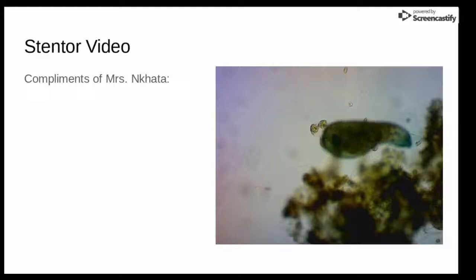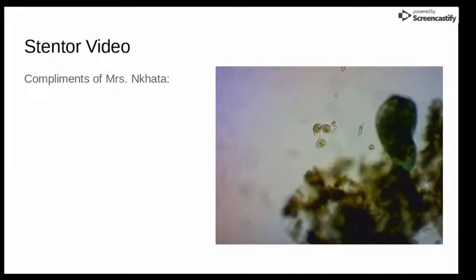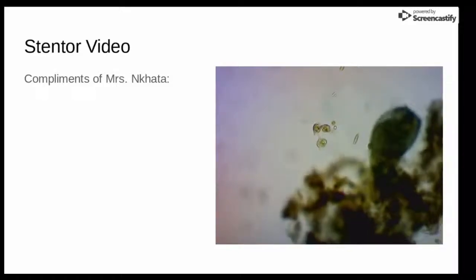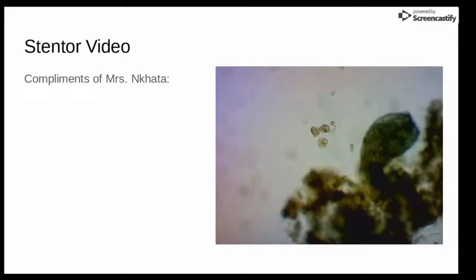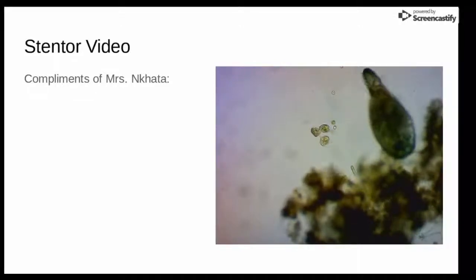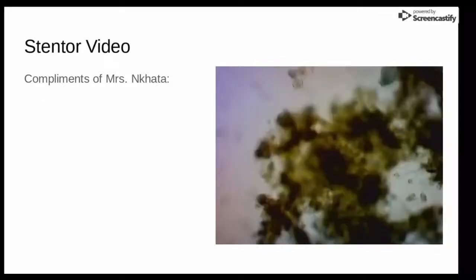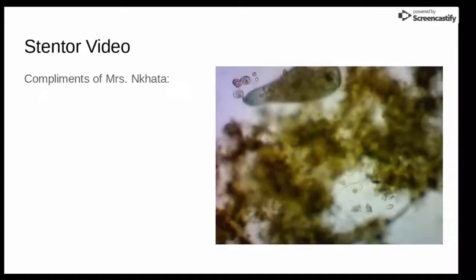The cilia on the end. Let's hope the fish larvae don't get it. Okay, and that is the stentor.